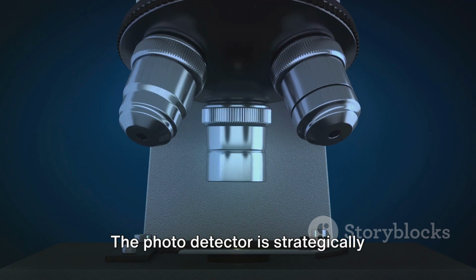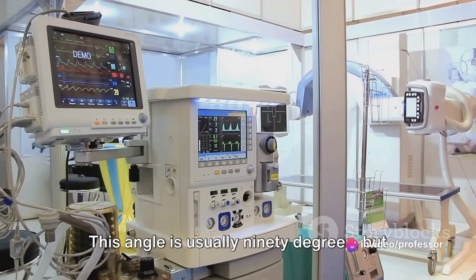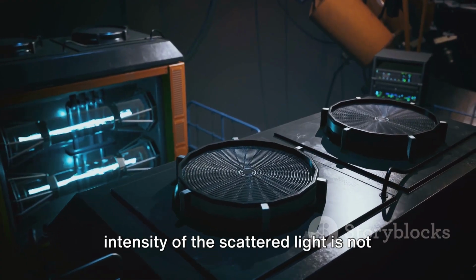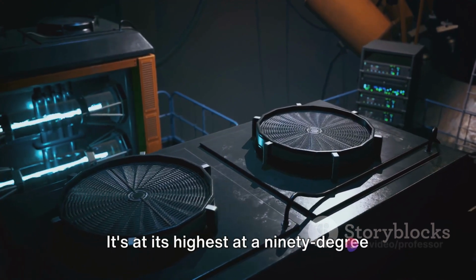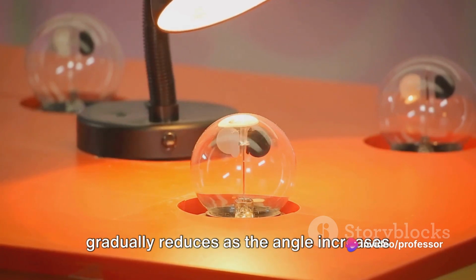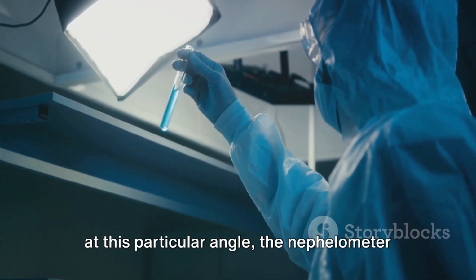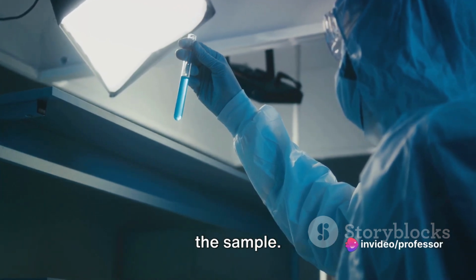The photodetector is strategically placed at a particular angle from the incident light. This angle is usually 90 degrees, but it can vary depending on the specific requirements of the experiment. This angle is crucial because the intensity of the scattered light is not uniform in all directions. It's at its highest at a 90-degree angle from the light source, and it gradually reduces as the angle increases or decreases from this point. By measuring the intensity of the light at this particular angle, the nephelometer can accurately determine the amount of light being scattered by the particles in the sample.